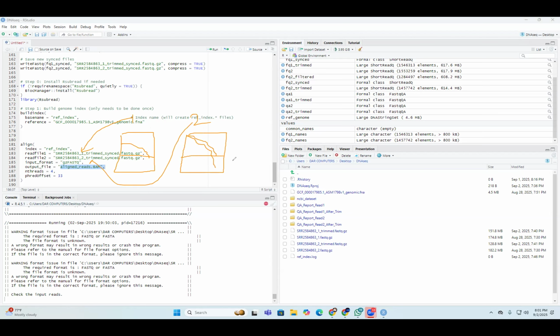If you want to make sure all reads are equal, instead of trimming at 20, if you trim at 30, where both files' reads are the same, you can trim here. For example, here is 30 and at 30 all reads are the same. I will trim at 30 so that the read numbers will be the same in both files. So instead of trimming at 20, if you choose 30, it will be best. I will show you the plot, then hopefully it will be more clear.